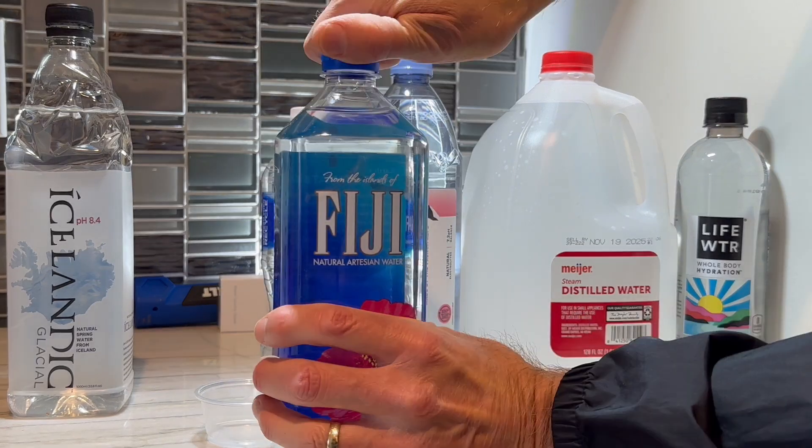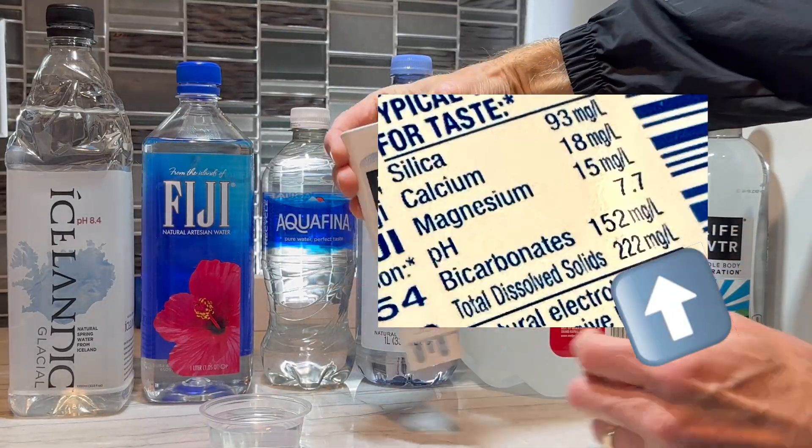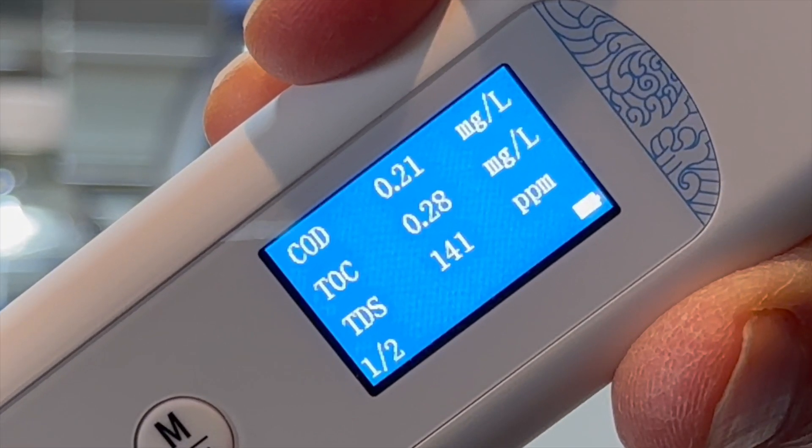Time to test some Fiji water. I'm particularly interested to do this test because the bottle itself reports 222 parts per million dissolved solids. It looks like our device measures this just a bit lower — TDS: 141 parts per million.